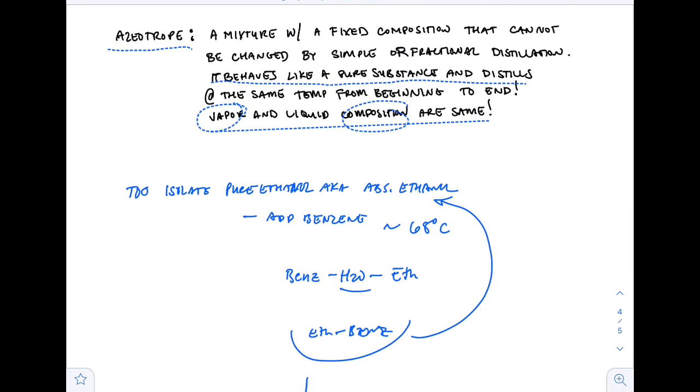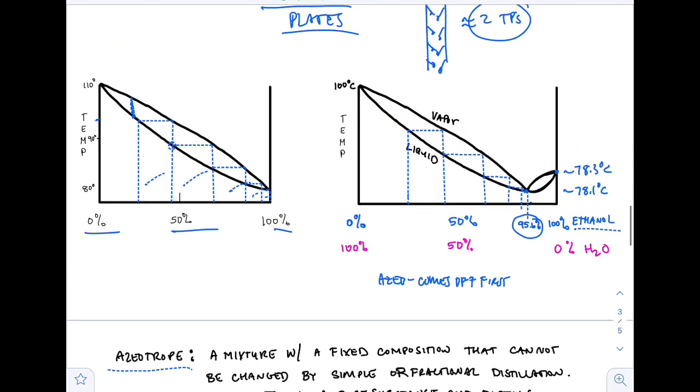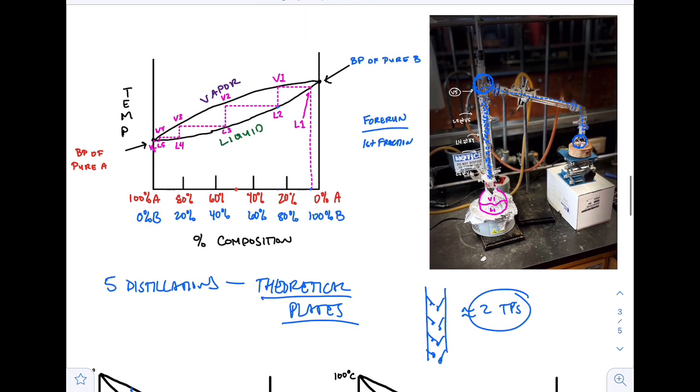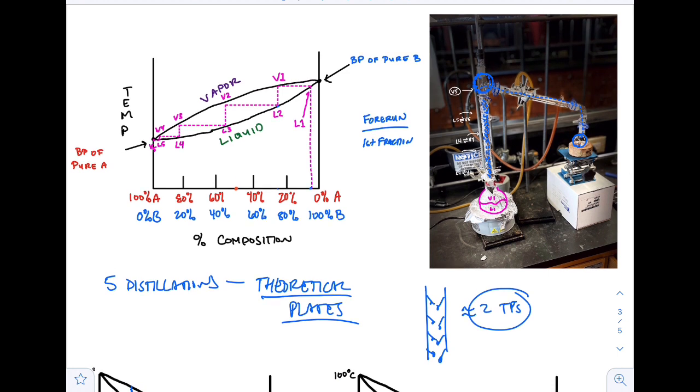What you need to do is calculate the percent yield, just to determine the maximum that we could have achieved, so you understand the volume of ethanol that we're really working with with respect to the water. This will help give you a better understanding as to why this process might be difficult. And yes, this is some fun stuff. It's a really cool setup. We're legit making moonshine, and we fancy. Keep in mind everything I said. Okay, thanks.